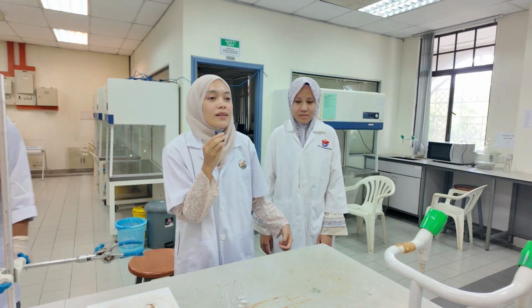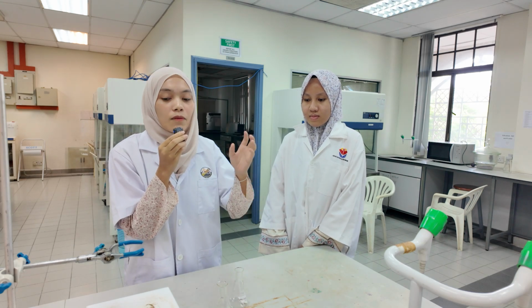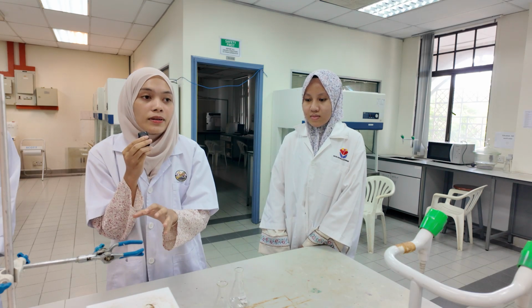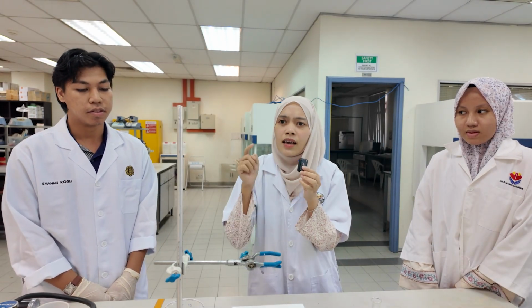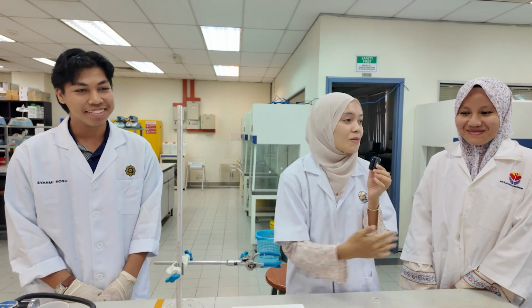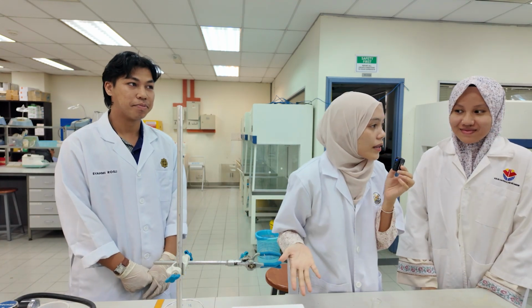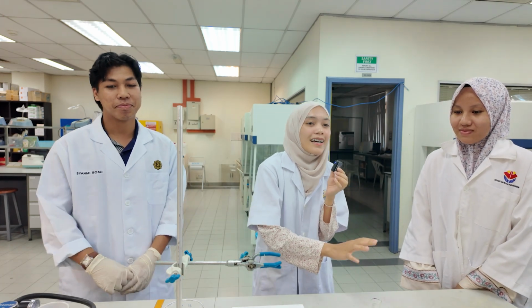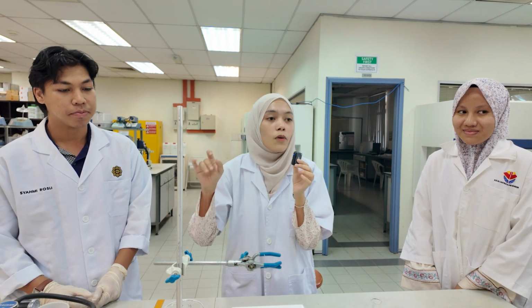Okay. For my part, I'll be discussing the principle of these experiments as applied in industry, which is recrystallization. Do you know what the final product is that our friend just presented? Okay, good, crystal. So basically the principle is the same, and it is used in several types of industry.